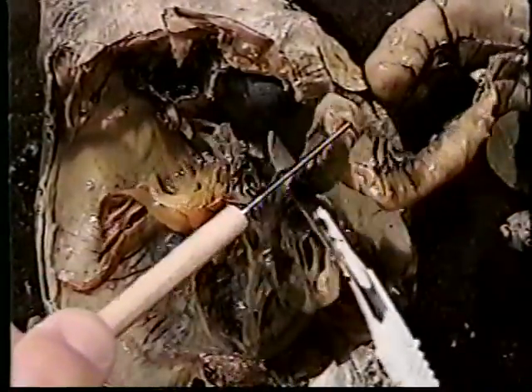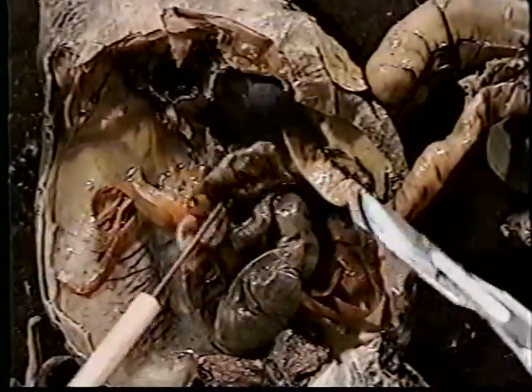This task can prove tedious, but it's very important to be able to view what still lies closer to the dorsal side of our organism.